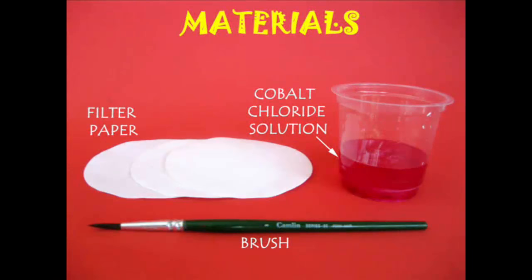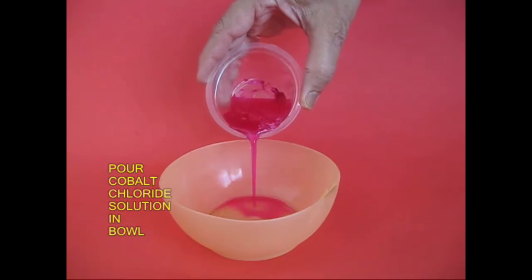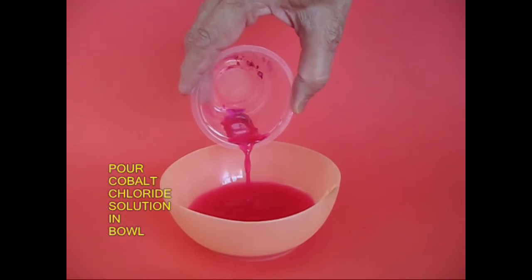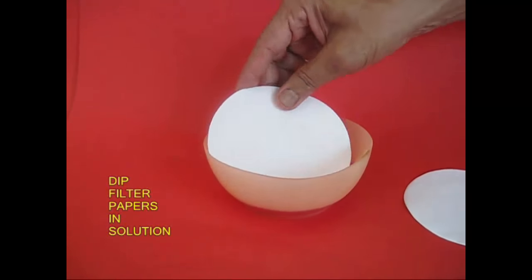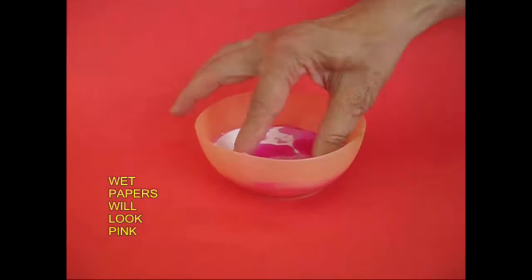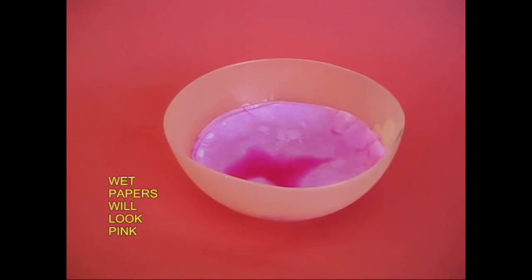Put a brush in a cup of cobalt chloride. Put a paper filter in a cup of cobalt chloride with a pink solution, then put a dry layer in the cobalt chloride.